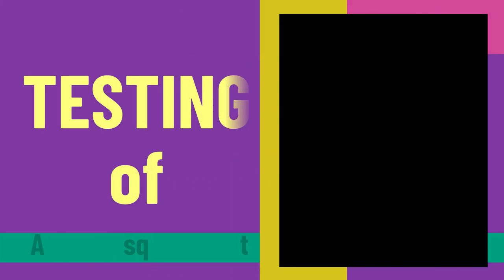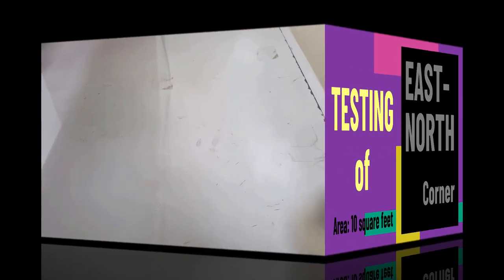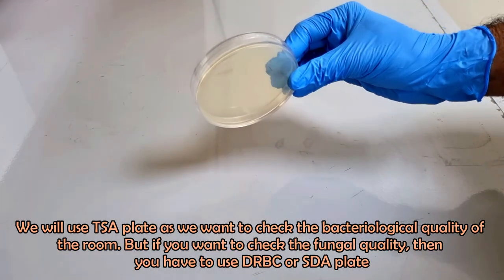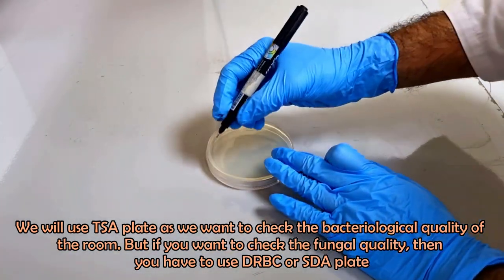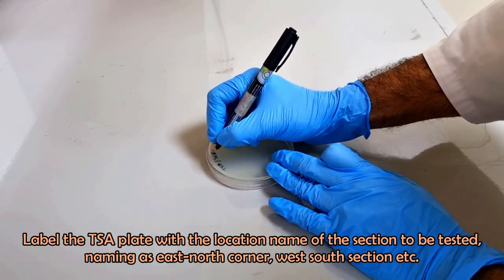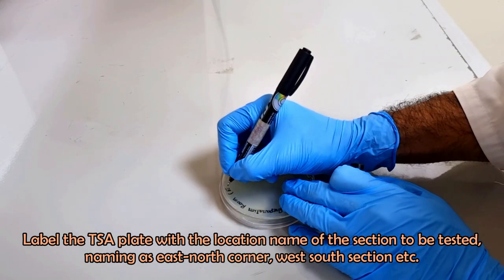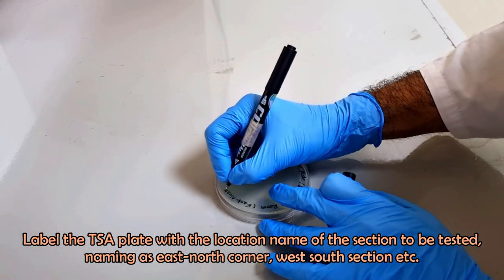Split the total room area into several sections of 10 square feet each. Label the TSA plate with the location name of each section, naming them as East North Corner, West South Corner, etc.